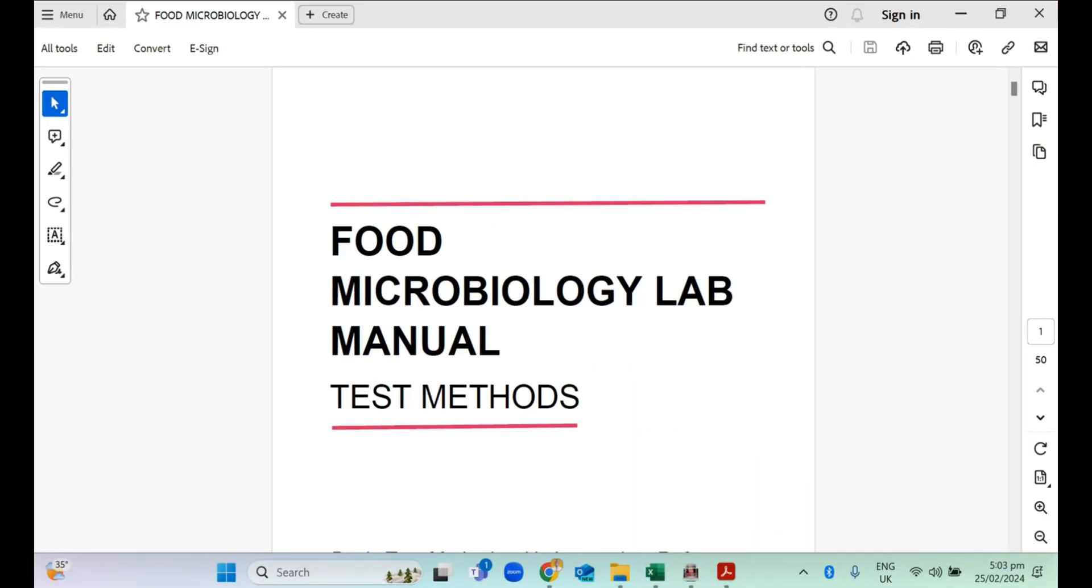Welcome. In this video, I'm going to demonstrate how to enter microbiology data, how to compute it, and finally how to include that in your thesis write-up or manuscript.